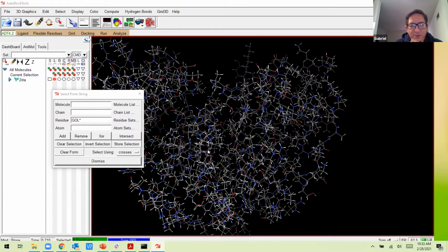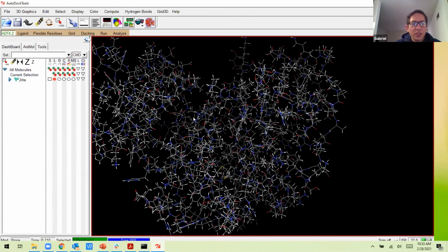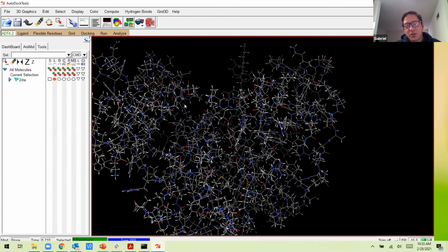Angie? Yeah. Okay, so I have done it. I'm not sure if everybody has done it. Let me know. So once we have the molecule ready, now we have to save it as a PDB file.